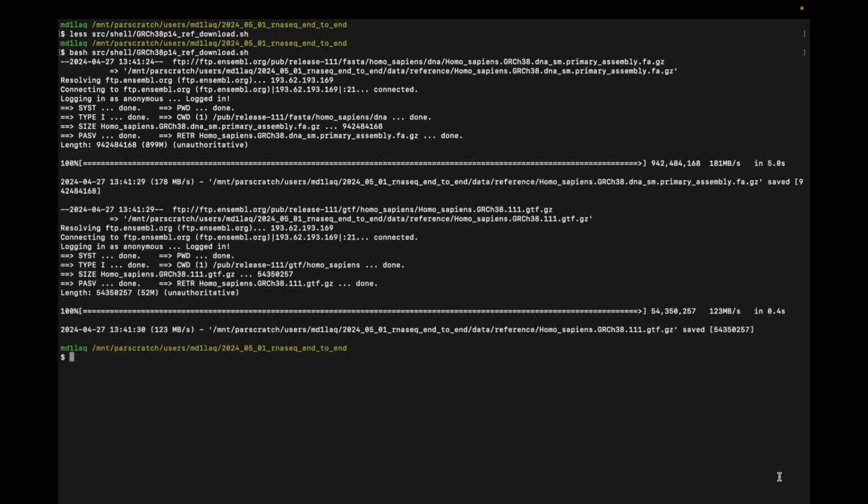Okay, so after that's run, the last thing that we need to do in preparation is to set up a sample sheet for the files. Now, don't confuse that with the experimental sample sheet that I spoke about being housed on the European Nucleotide Archive that describes the actual experiment. This is the one that NF-core requires to understand which files we want to analyse, how many lanes the samples have been run across, whether we've got paired or single-end reads, and what the library prep protocol was.